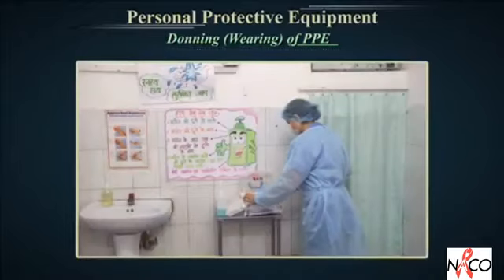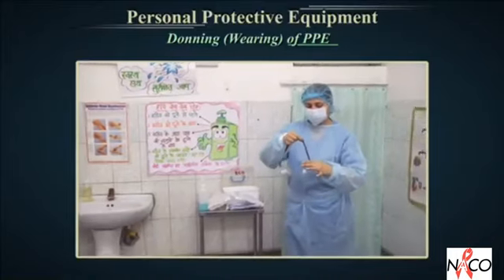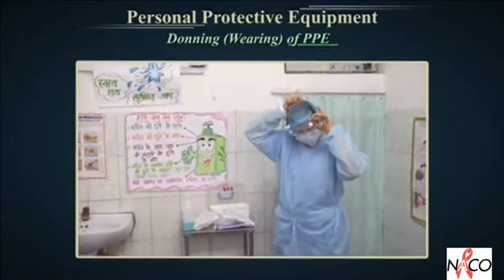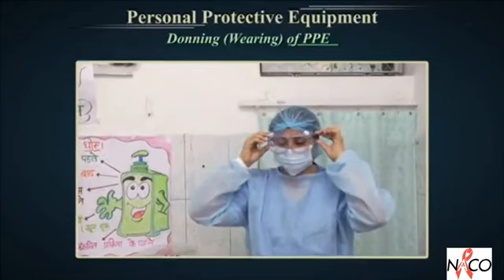If the respirator you selected does not contain eye protection, then a separate eyewear must be worn to protect from splashes or sprays of infectious material. Protective eyewear may be safety glasses or goggles. Many shapes and styles are available.